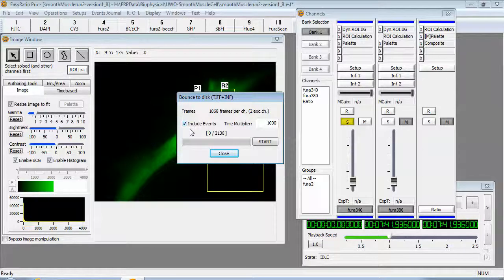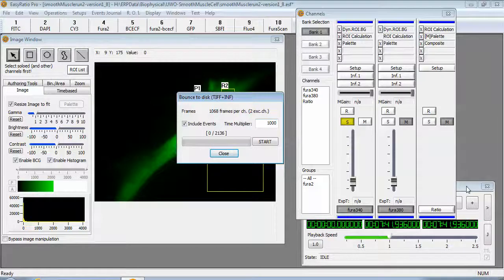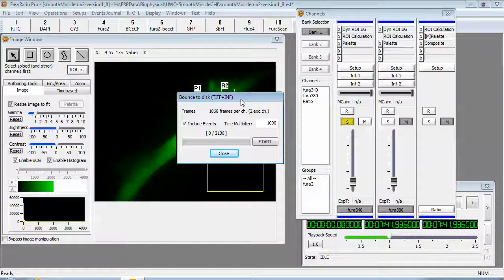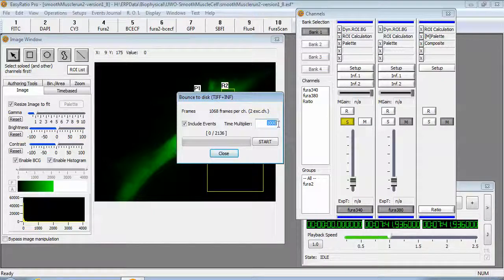Metafloor can only carry two significant digits. EasyRatio Pro has many more than two significant digits. So if you wish you can use a time multiplier to multiply the output to a compatible Metafloor.